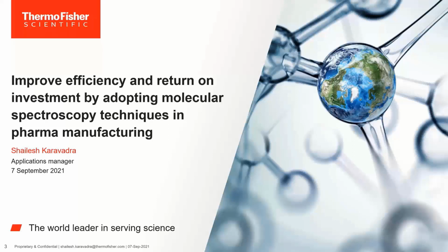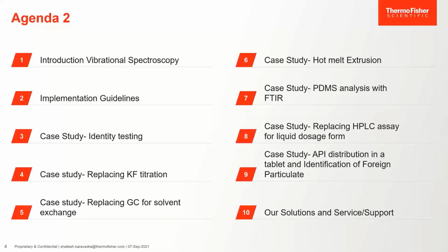Today's topic is to look into how to improve the efficiencies and increase the return on investment by adopting so many of the molecular spectroscopy techniques like Raman, near infrared, infrared in pharmaceutical manufacturing. In today's agenda, I will talk briefly about vibrational spectroscopy. What is vibrational spectroscopy? How do infrared, near infrared, and Raman spectroscopy differ?